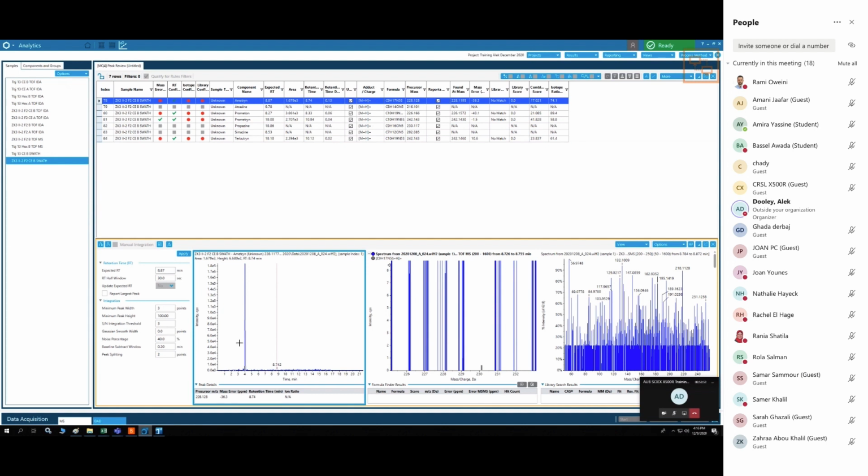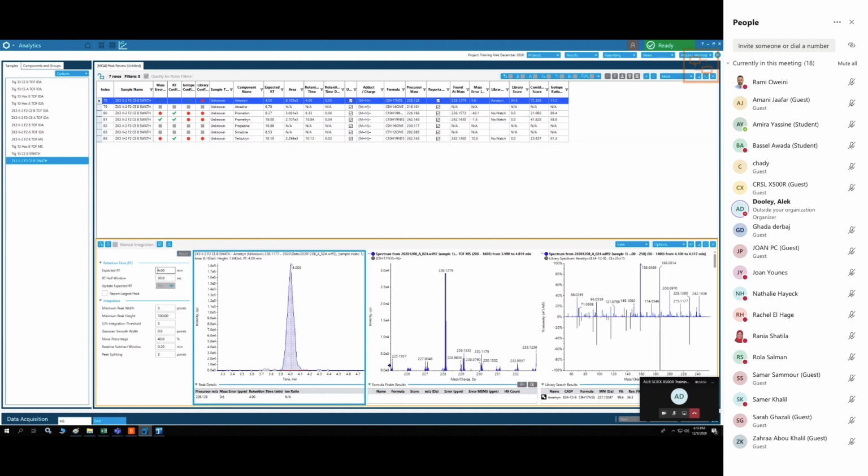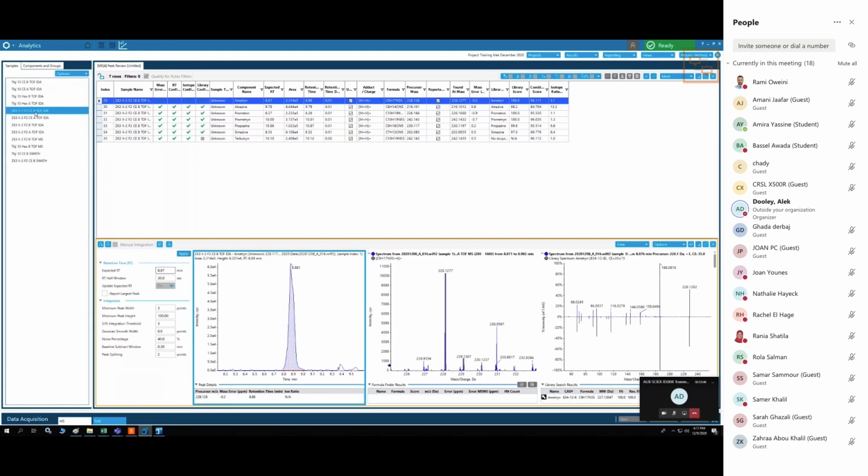Now this is early too. ZK 2F2 E. This one? No. It's got to be equilibration time. Is it early, late, and early? It's all over the place. Yeah, I'm trying to.